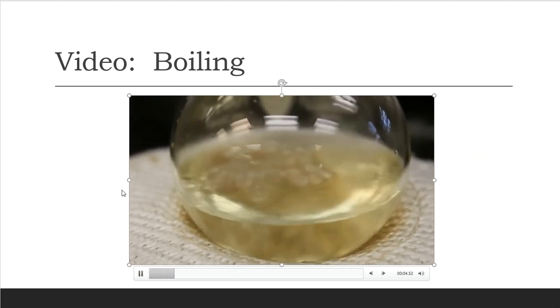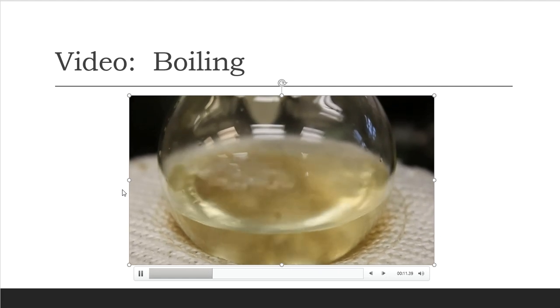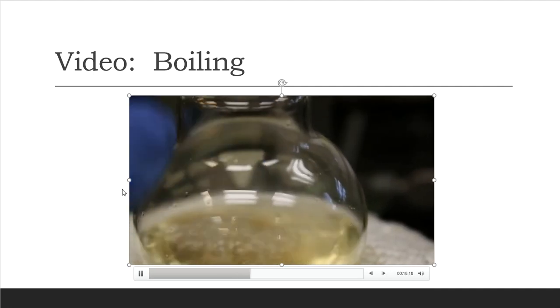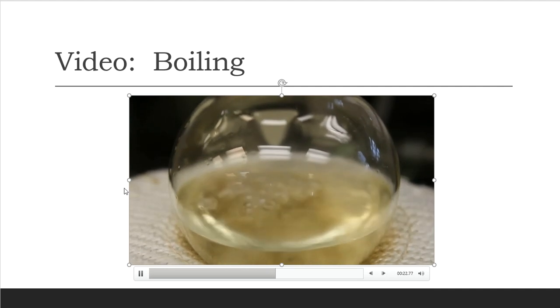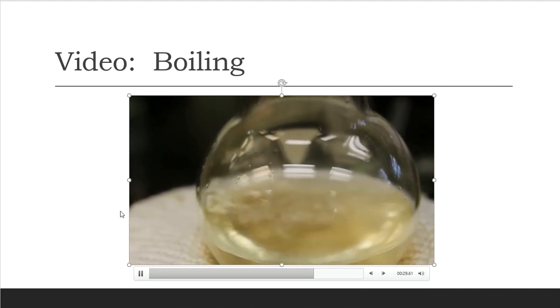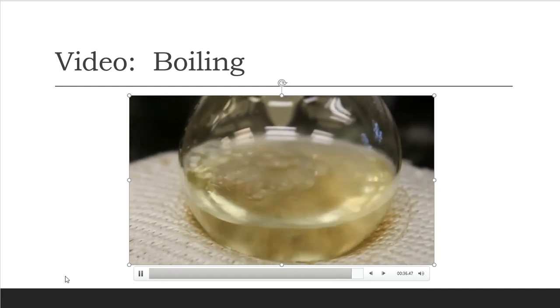Okay, so here is my organic product. I'm starting to get a boil that's coming from this product. That's okay. We had some organic solvent in here that needs to boil off and over. So that's what's happening right now. So I'm finally getting to a boil. I don't see any condensation happening up here at the top of my round bottom yet. So it hasn't quite made its way up through. However, shortly it will start to probably drip, drip, drip into my beaker that sits over to the side, and that way I can collect this impurity that is still present.